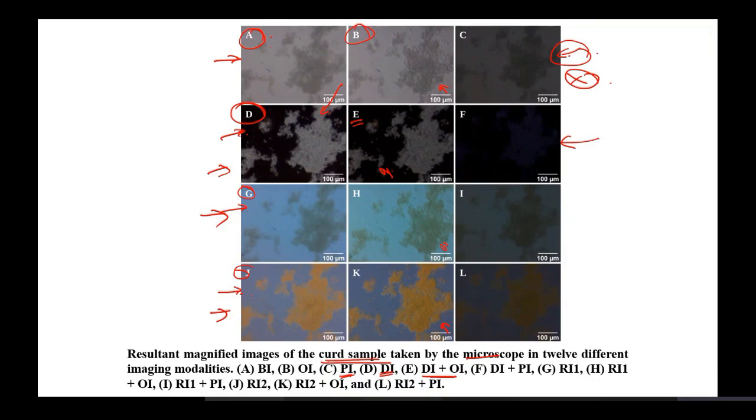Similarly, over here also it acquires the blue, and if you look at the foreground region, it appears as a golden color over a blue background. Our system does not have color information, except this one small microbe, which is due to the presence of lactobacilli. Now, if you look at this image, blue background, yellow foreground, with your oblique illumination, if you compare the quality, the contrast of this image is quite high.